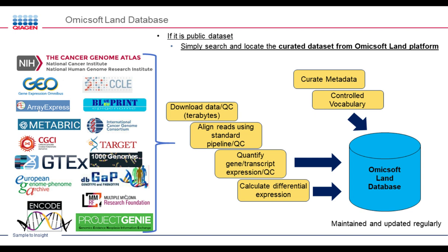After you download, you would have to align the reads to the reference if this is RNA-seq NGS data. And then you would quantify gene and transcript expression, and do differential expression as I mentioned in my previous slide. So you would have to do all of this by yourself.